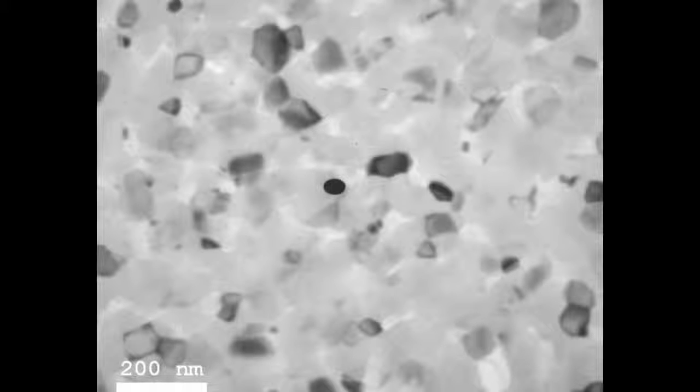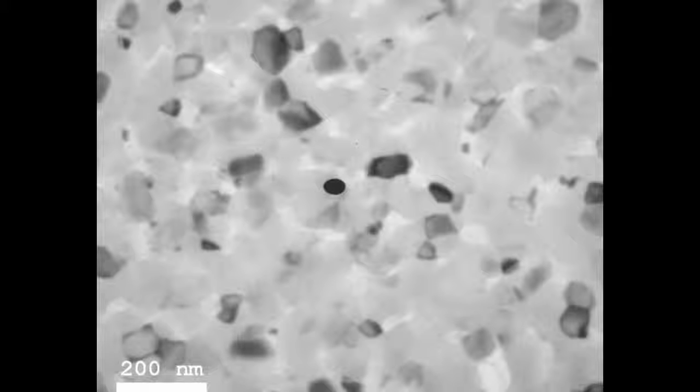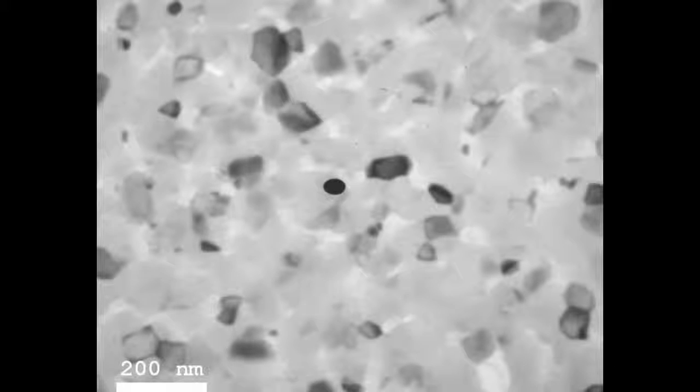As I told you, the objective aperture in the back focal plane can be used to cancel out the deflected electrons in the sample. And that's what I've done here. All the electrons that have been deflected due to this Bragg criteria have been cancelled out by the aperture. And that's why some regions have become black. And that's what makes us able to see some of the grains.